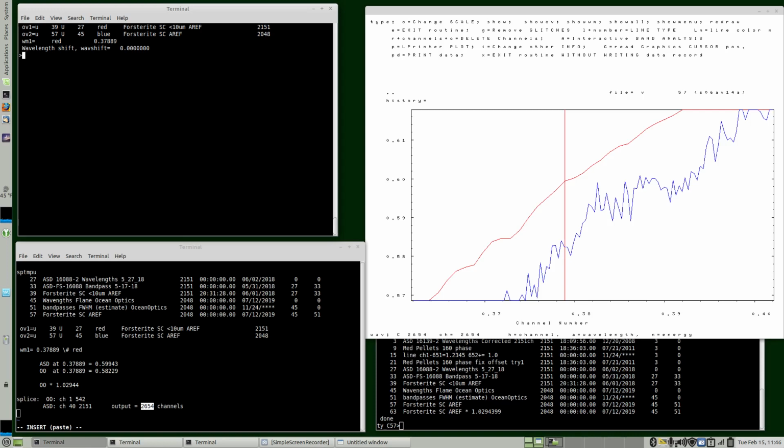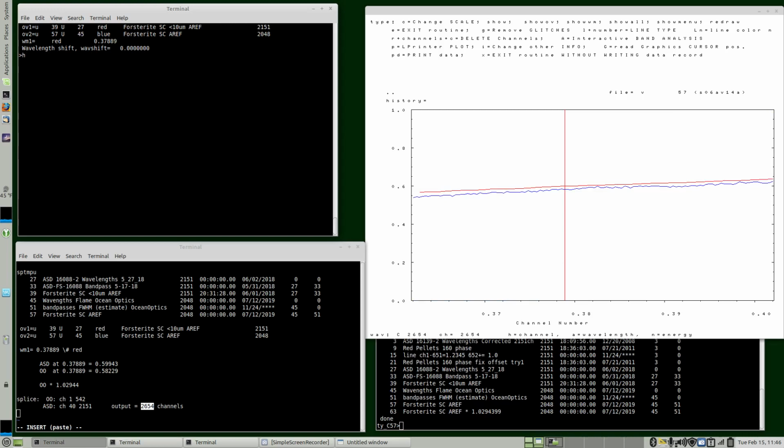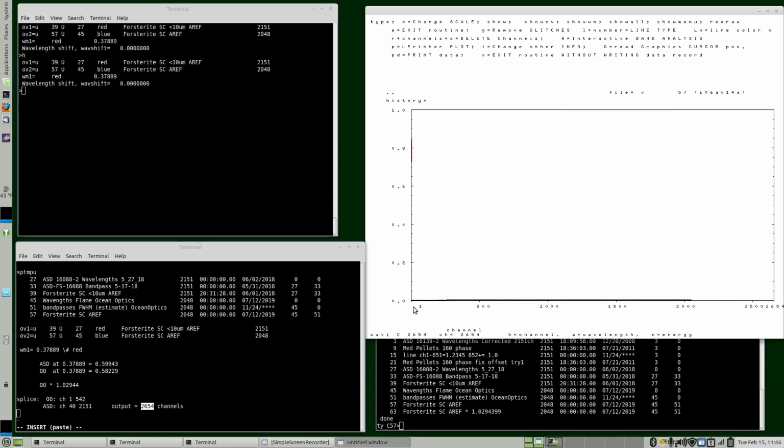So I'm changing the mode to channels down here, and this will show us just channel number. Okay.